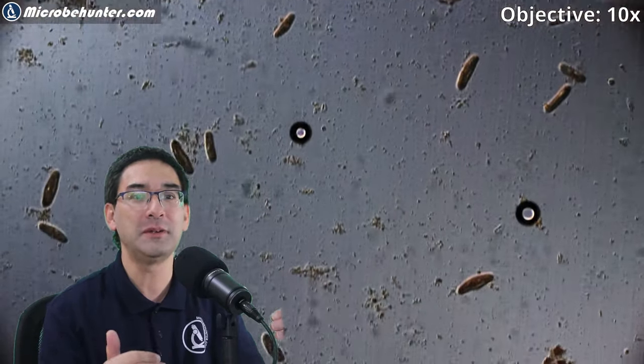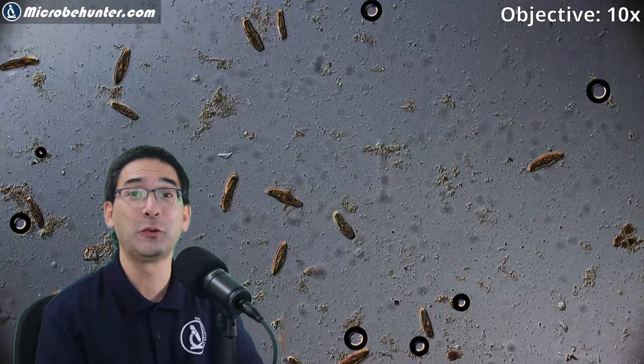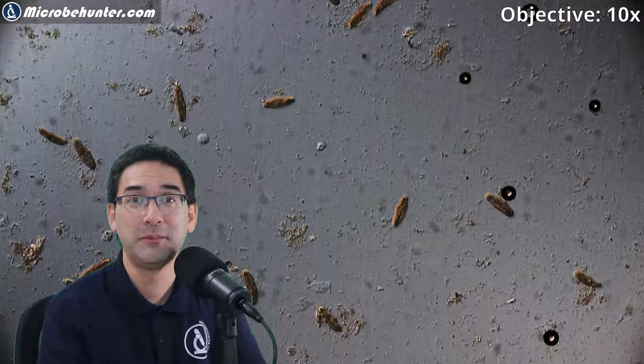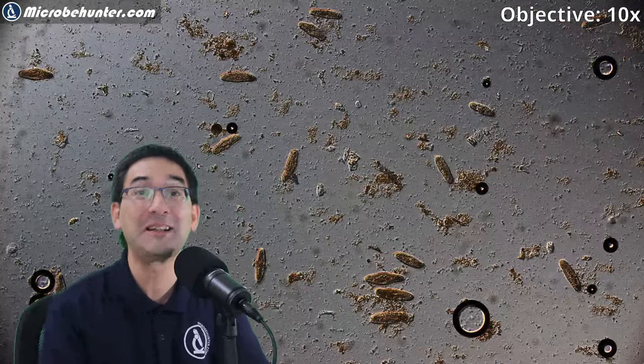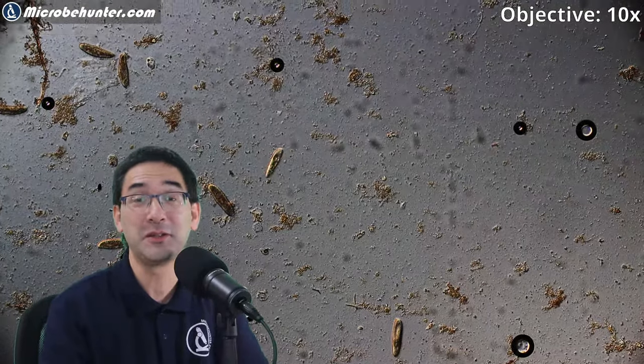If you move down a little bit you can see that many of them have already died and are just scattered around — it looks a little bit sad, I have to say. But I've got many more in my jar because I've been breeding them precisely for this purpose.